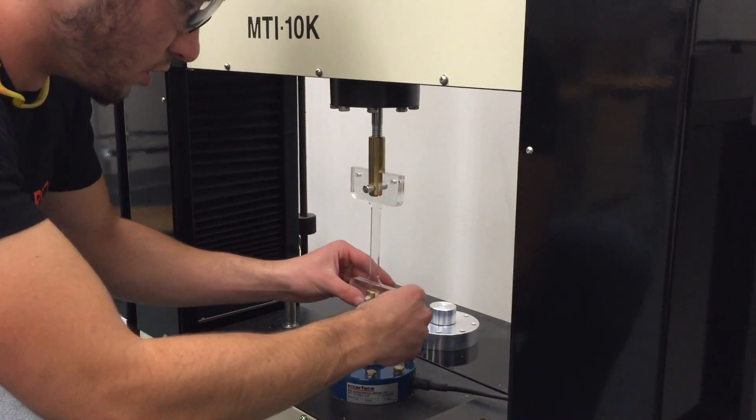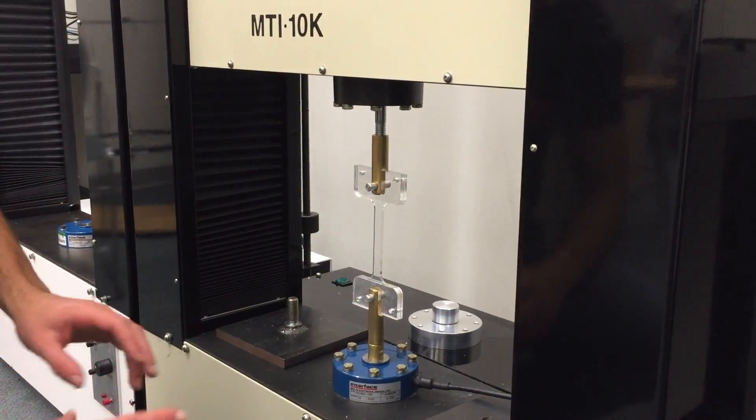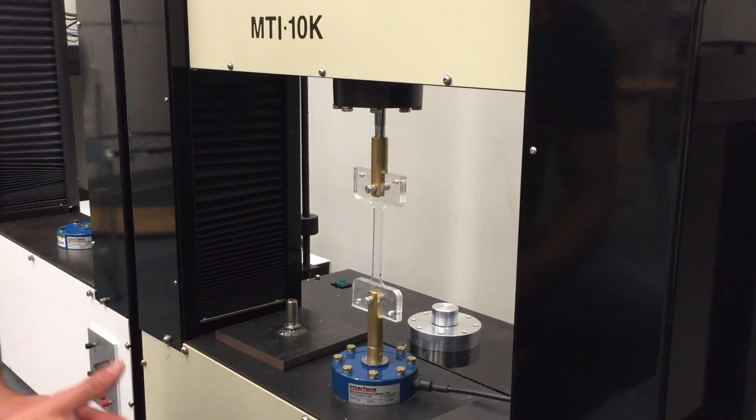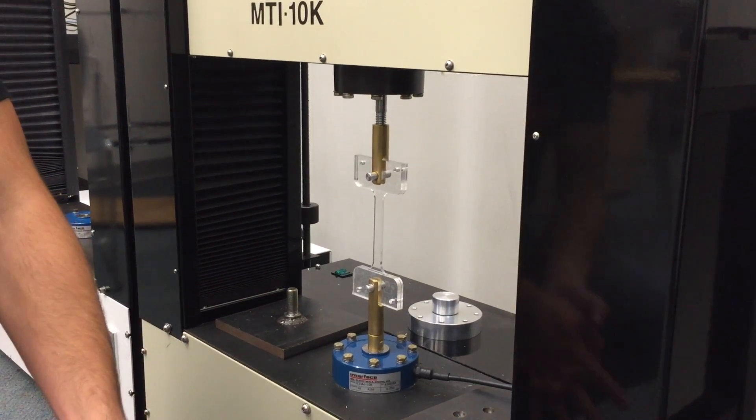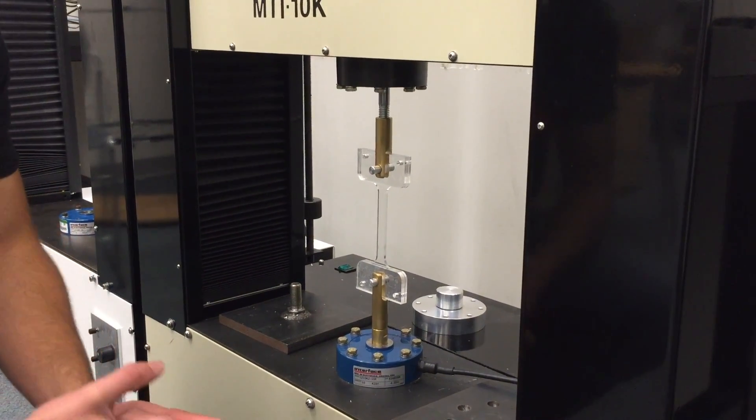We can now leave the test specimen in as such. When we go to the software, we can select for it to be preloaded. So I'll pass you off to Eric.